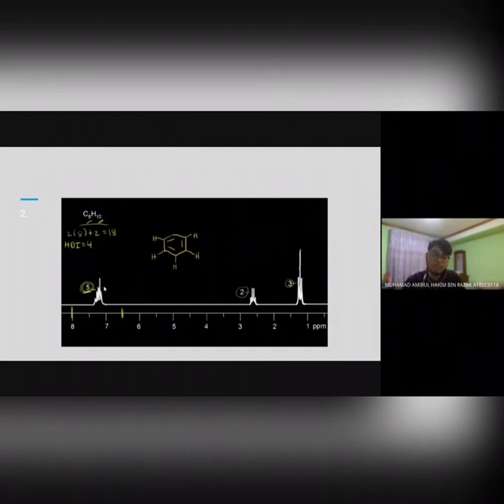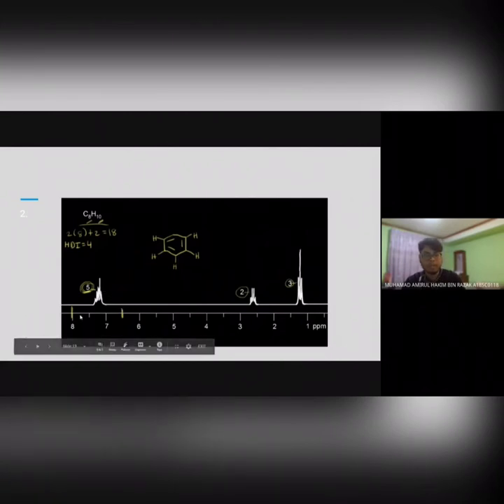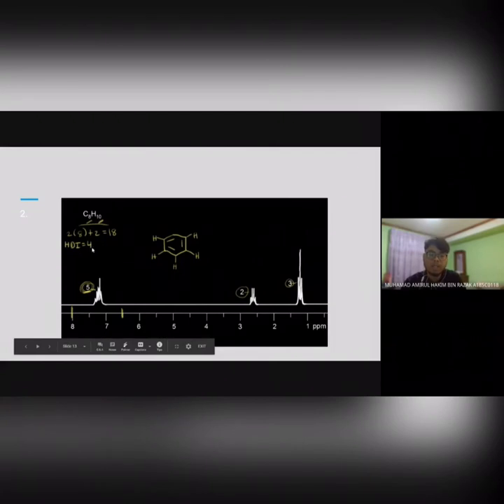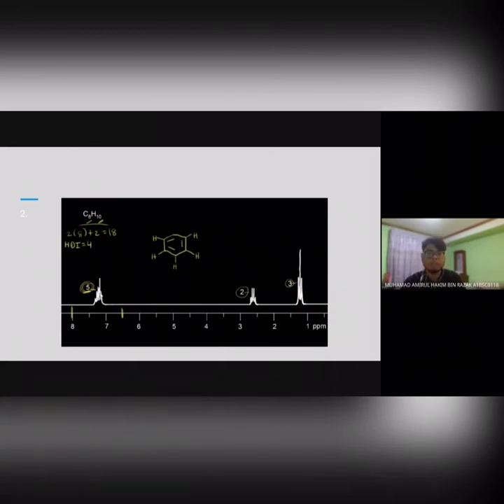Okay, peak yang pertama berada pada range 6.5 hingga 8, which is itu adalah range untuk aromatic punya range. Okay, so kita pun dah determine HDI sama dengan 4 akan hasilkan aromatic dan range peak ini kiranya confirmkan kita punya HDI tadi. So 5 ini adalah nilai proton, okay, nilai hidrogen. So disebabkan 5 ini berada pada peak aromatic, so kita hanya letakkan kelima-lima hidrogen pada ring aromatik kita. Okay. Itu adalah peak yang pertama.